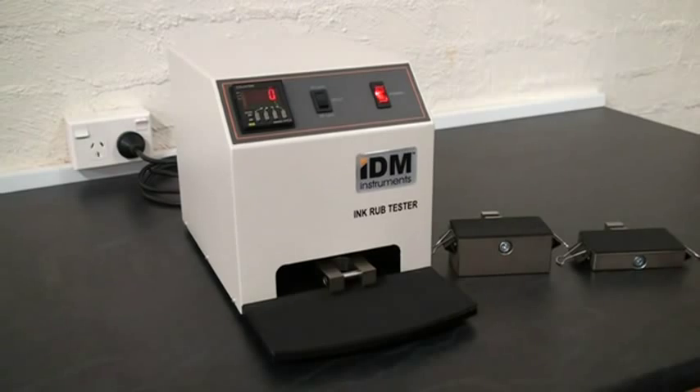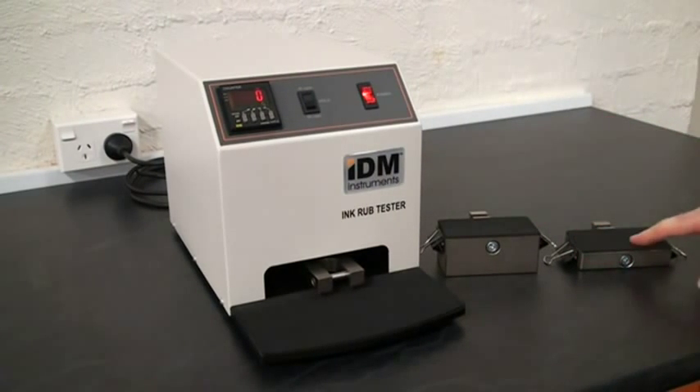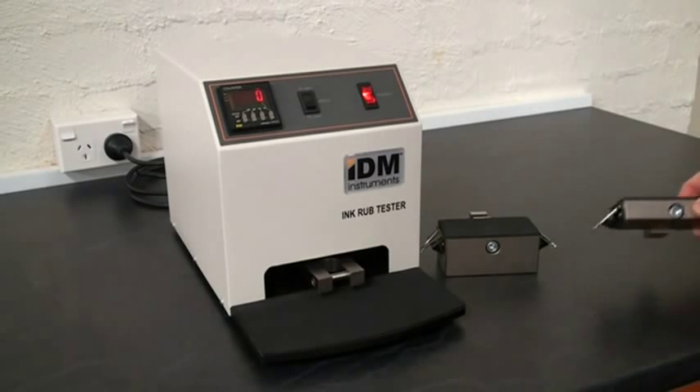The IDM Ink Rub Tester also includes a 4 pound and a 2 pound weight. For this demonstration, I'll be using the 2 pound weight.